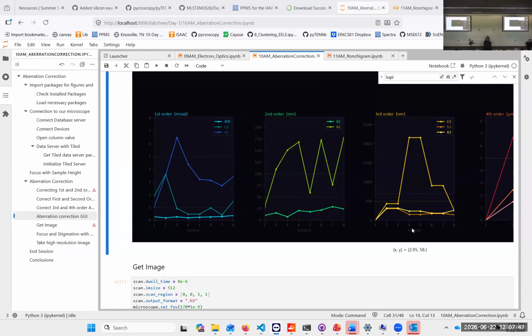A nice column contrast. Okay, actually we can show the problem, but if you have a nice column contrast and one is off, then you have a problem with other aberrations, I would think. That sounds to me like B2, but without being on the microscope, this is very hard to judge.